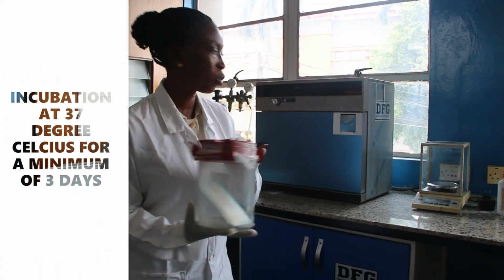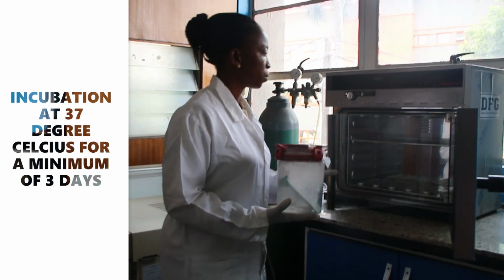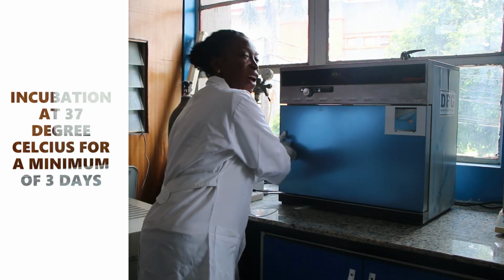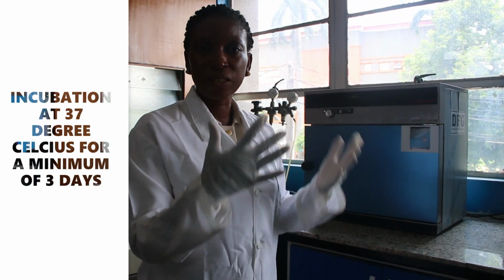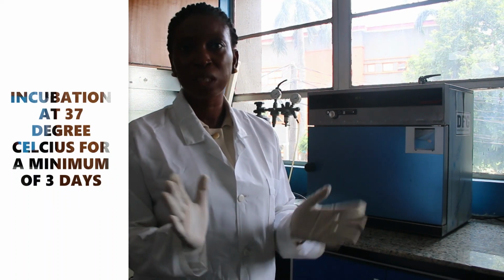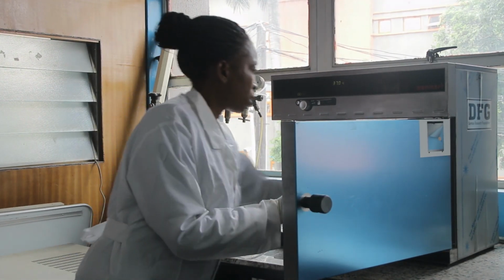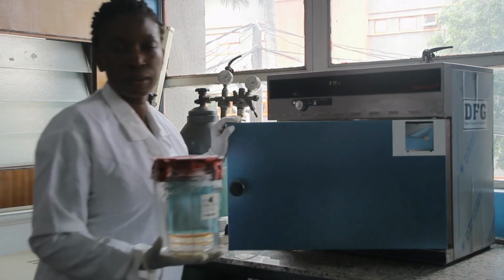Incubation will be done at 37 degrees Celsius for a minimum of 3 days and maximum of 10 days. At the end of 3 days, if there is no visible growth, the gas pack will be changed and incubated further for 5 days. If at 5 days there is no visible growth, the gas pack will be changed and incubated for a maximum of 10 days. After 3 days incubation, the gas jar containing the cultured plate will be inspected.